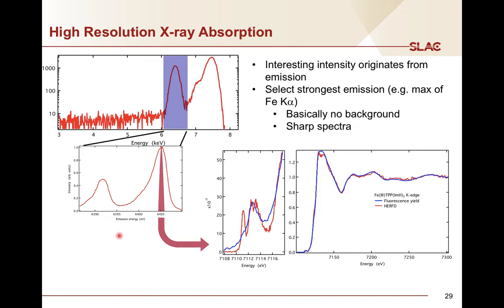When we now put in our emission spectrometer, where we can distinguish between K alpha 1 and K alpha 2, and we have an energy resolution of below an eV, then everything that we windowed out before now is this whole spectrum. And out of this spectrum, we set the energy that we detect, our spectrometer, to this energy region here. So we gain a lot in energy resolution.